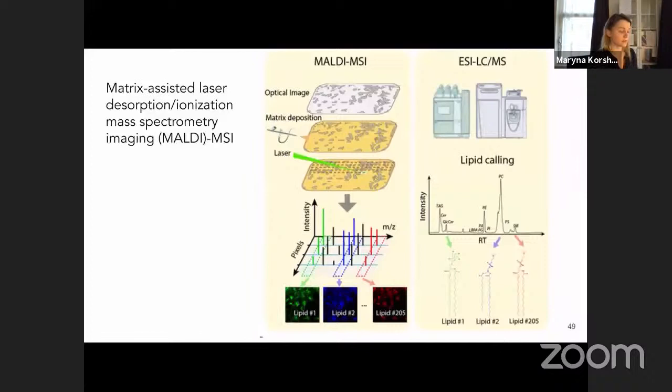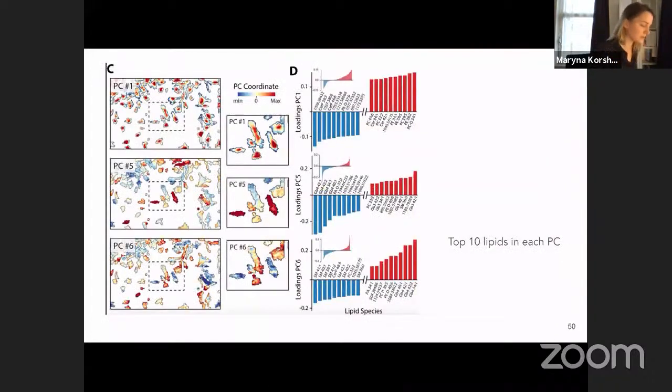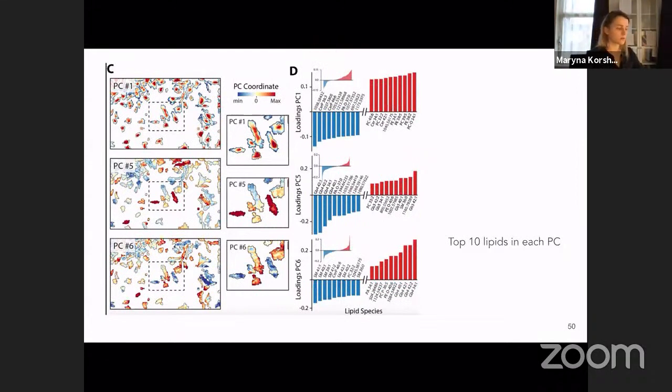What I really love about this paper is that I was surprised that the data processing approach was pretty similar to single cell transcriptomics itself. So after processing of the different samples from these matrices, they got a list of different molecules and their intensity, like the approximate amount of each molecule in the sample, and did PCA analysis.